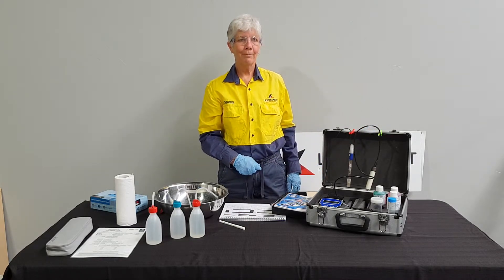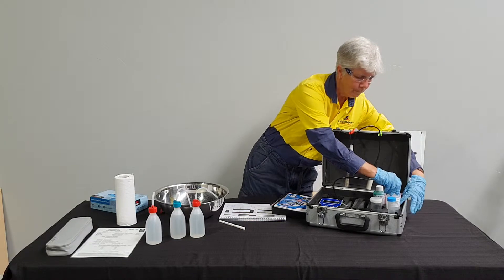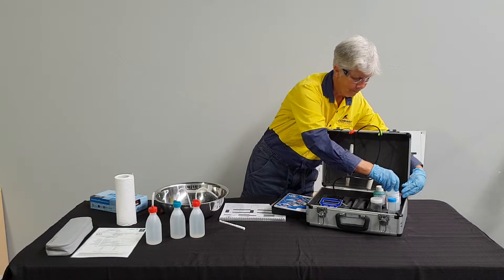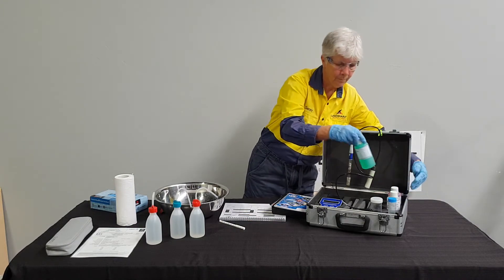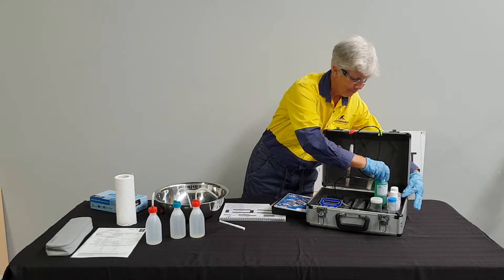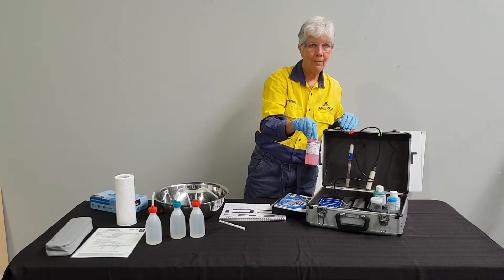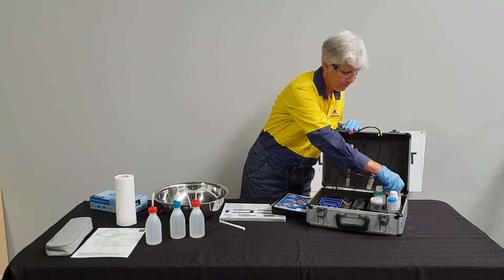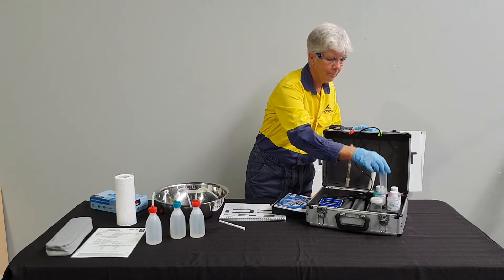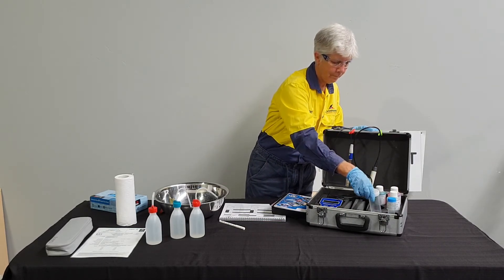The kit also contains some chemicals used for calibrating the meter. The kit will have two different containers. The smaller one is a falcon tube and the larger one is a sample tube. Both are used in the calibration process.